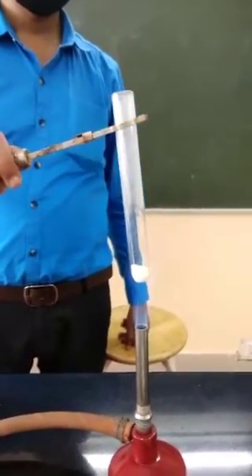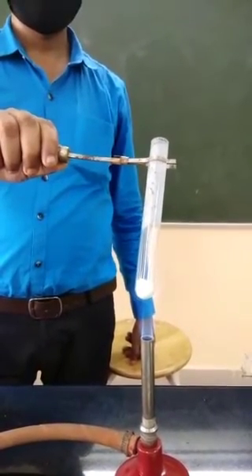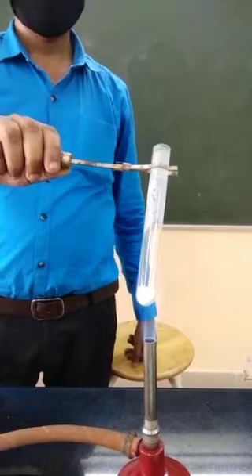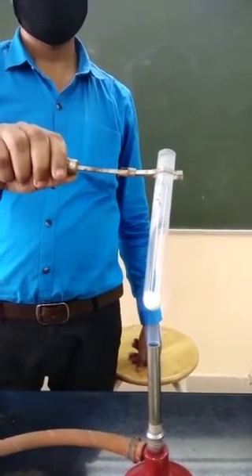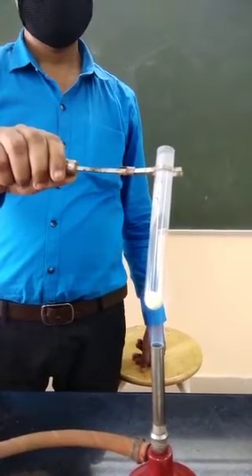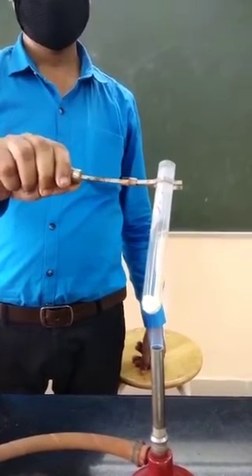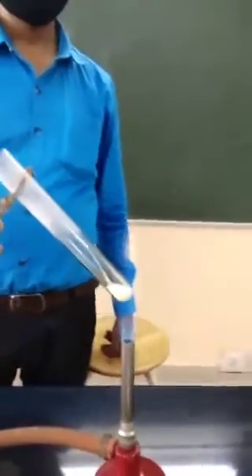Now you can see here, on heating this compound is changing to yellow. That means on heating zinc carbonate, a yellow residue is formed. But this yellow residue, when it cools down, changes to white color.